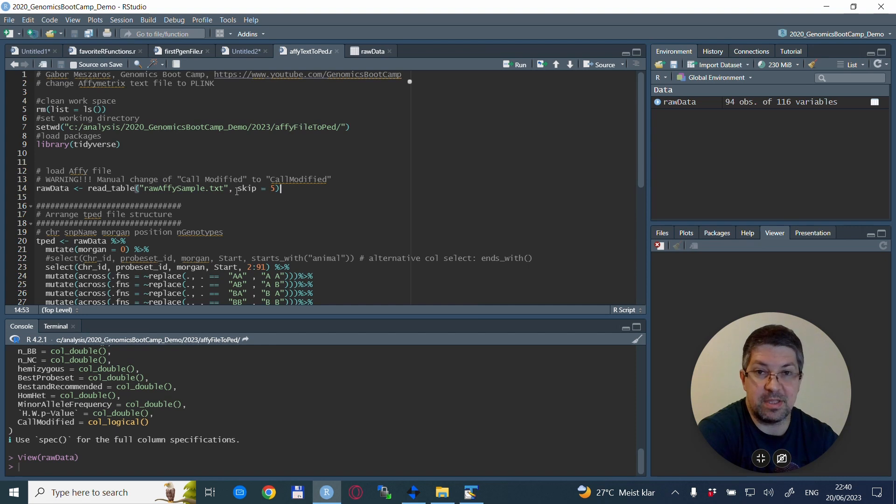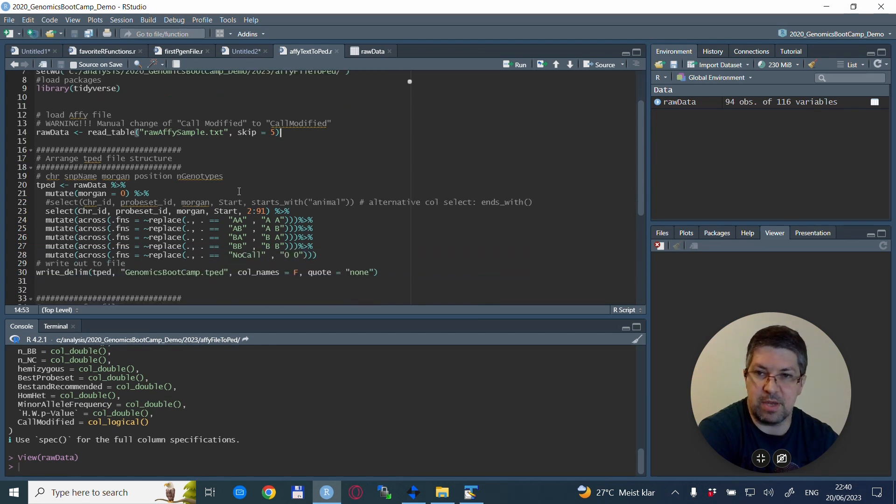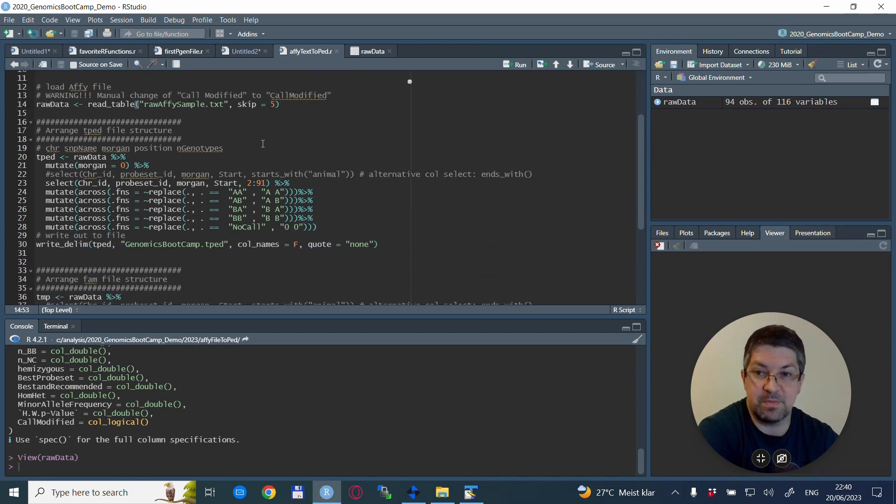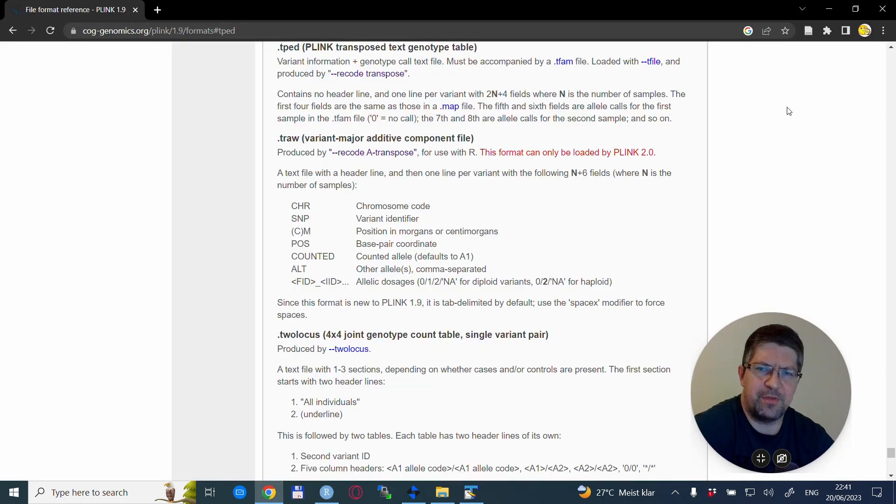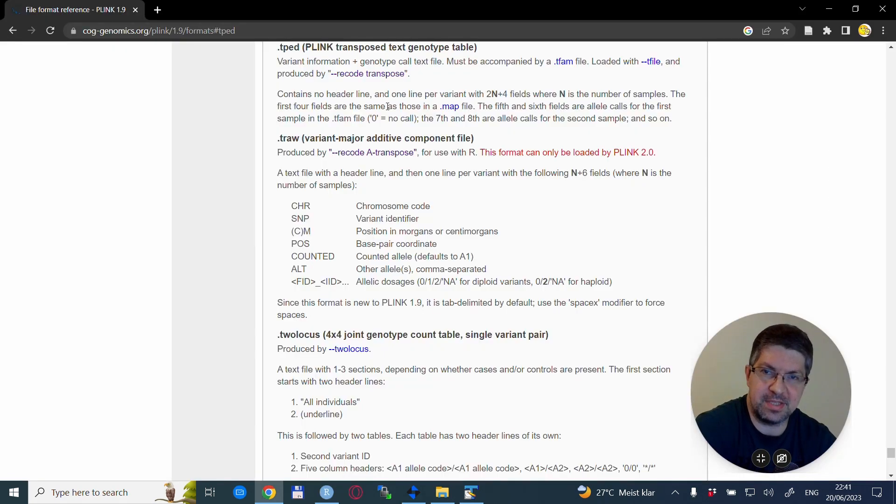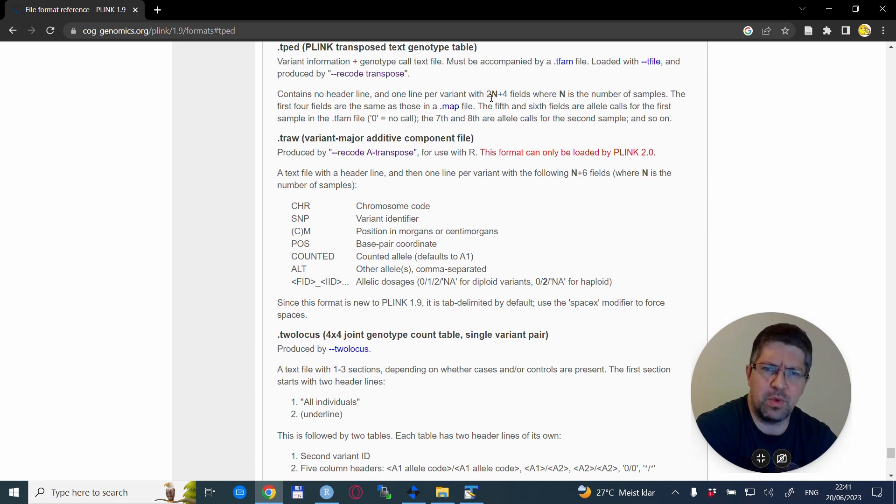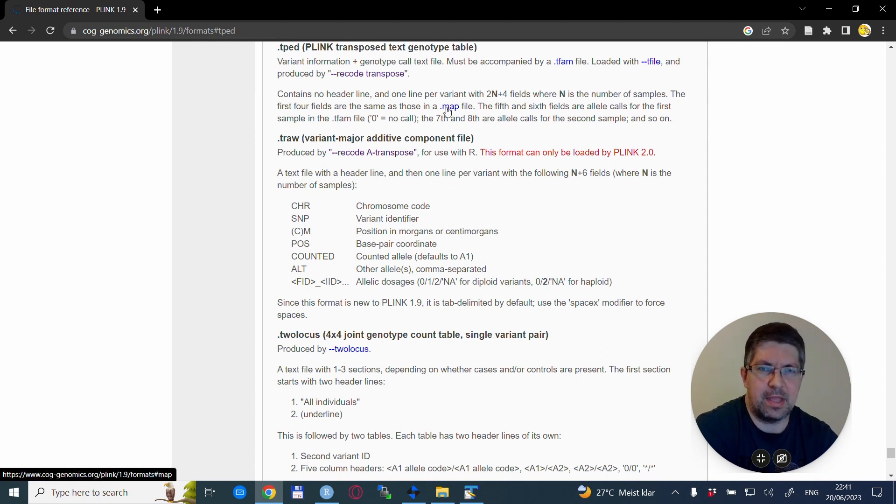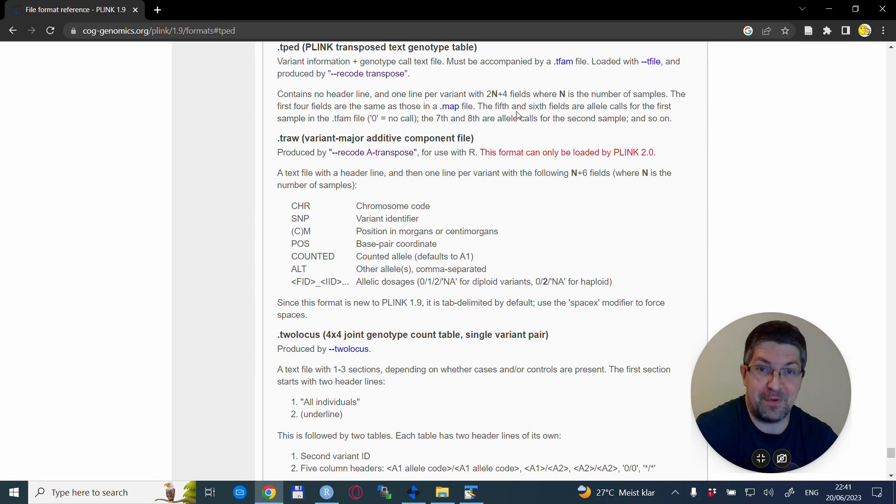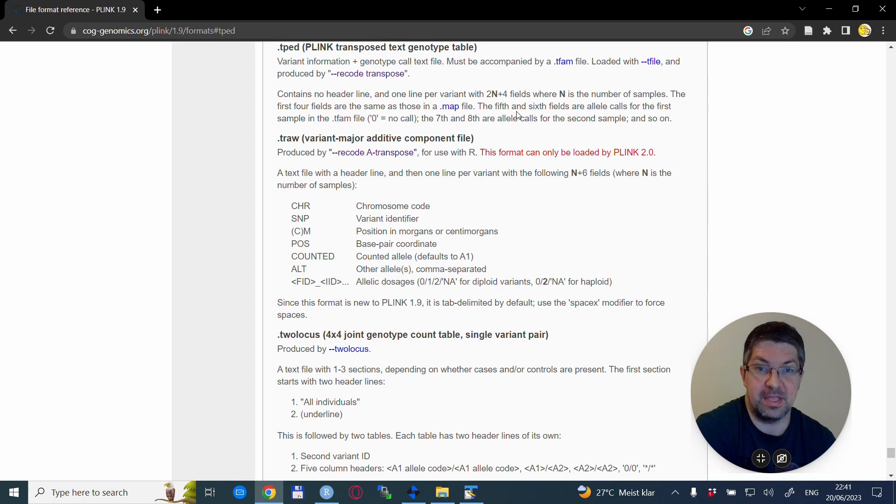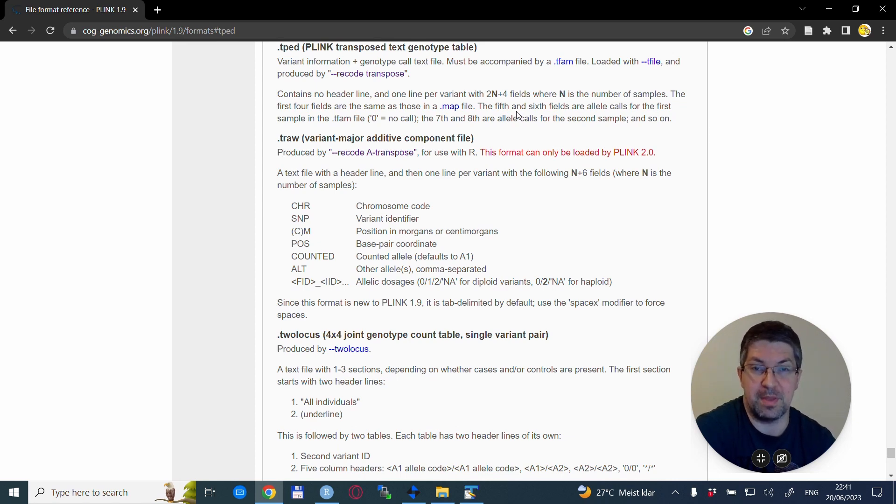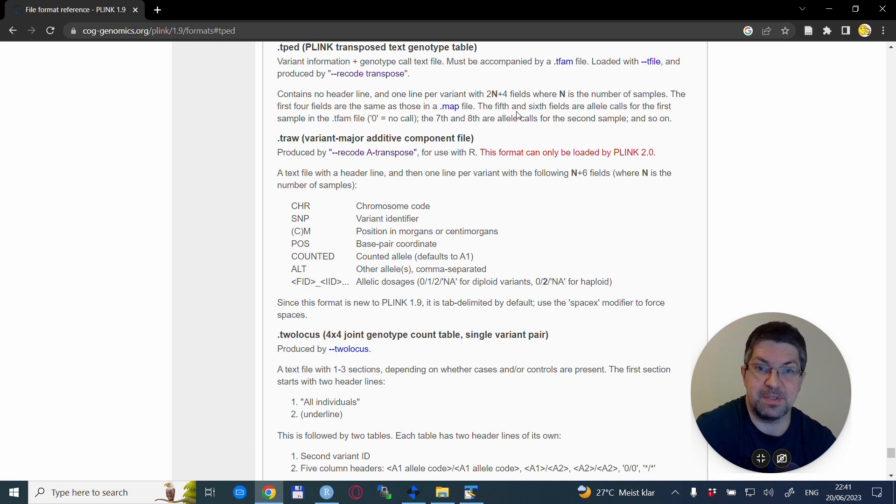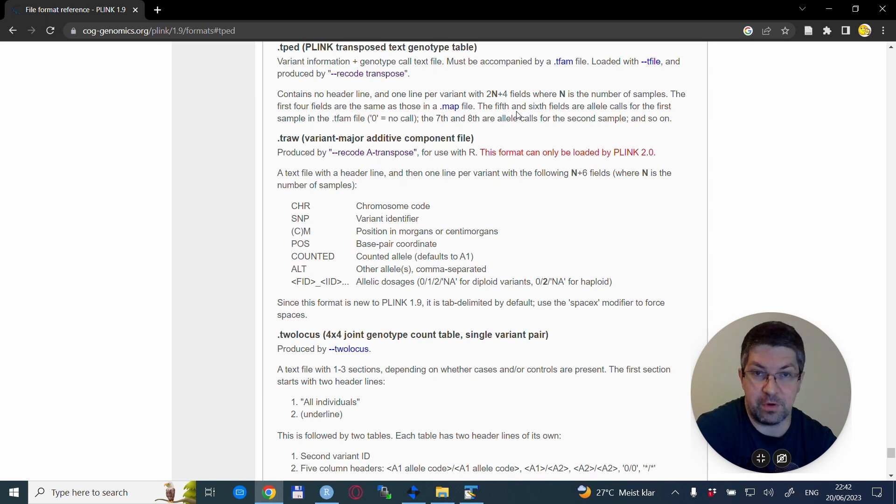And as many columns, or twice as many columns, as many SNPs you have. Now, this is an opposite one, or a transposed ped file. So in here, the individuals are the columns and the lines are the SNPs. So we need to change that and adapt it a little bit so it is a regular tped file, or transposed ped file.